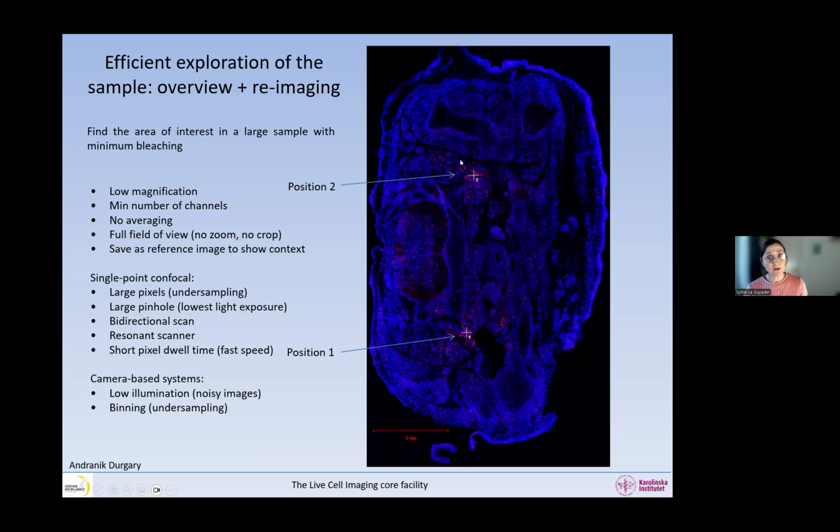And that can be done again on any macroscope where you have an automated stage. You can do that, right? So you can use this overview to navigate and move the stage to these places.